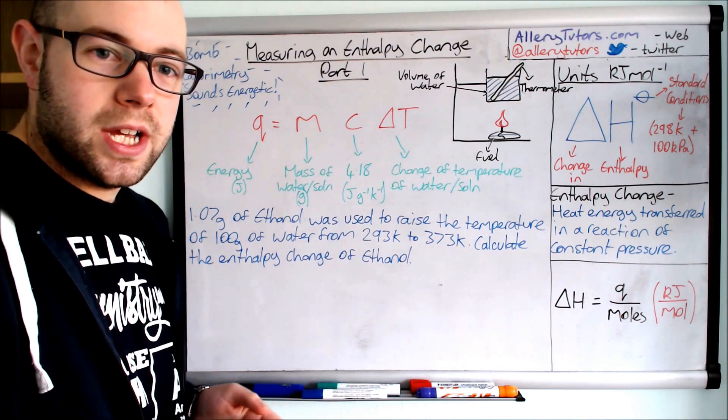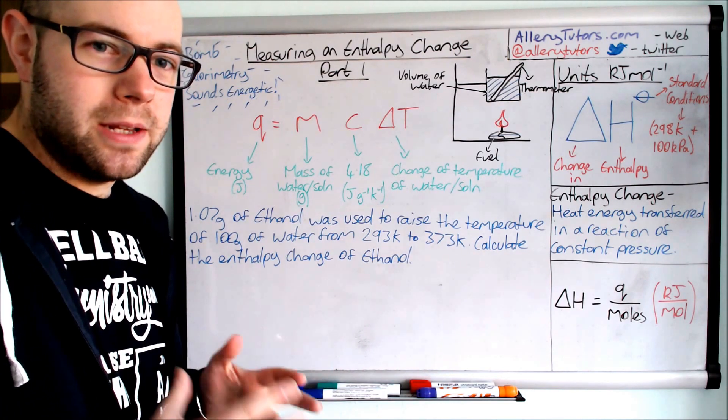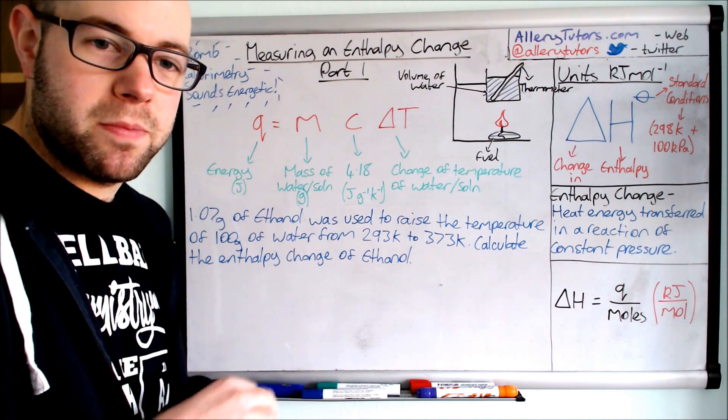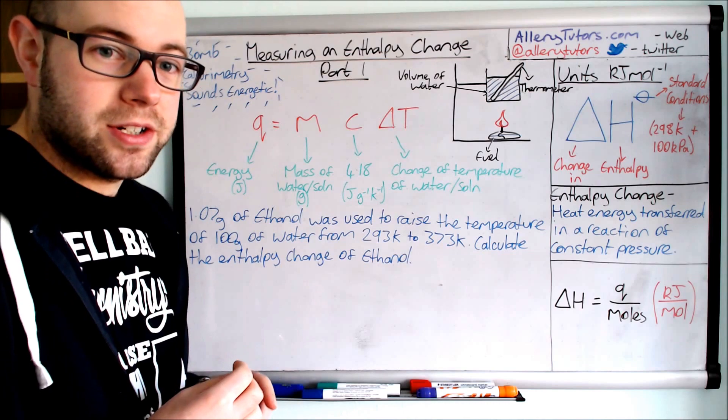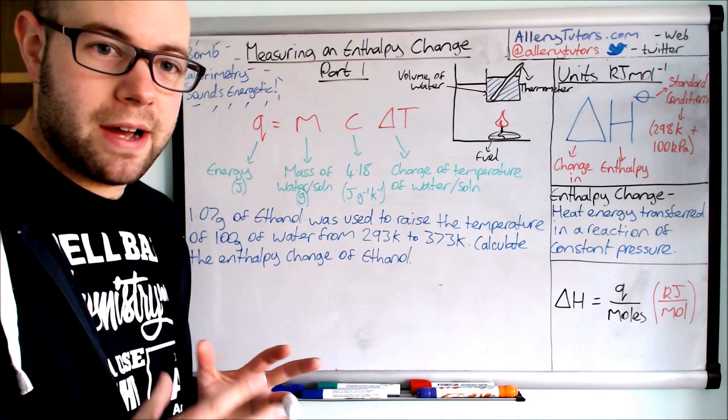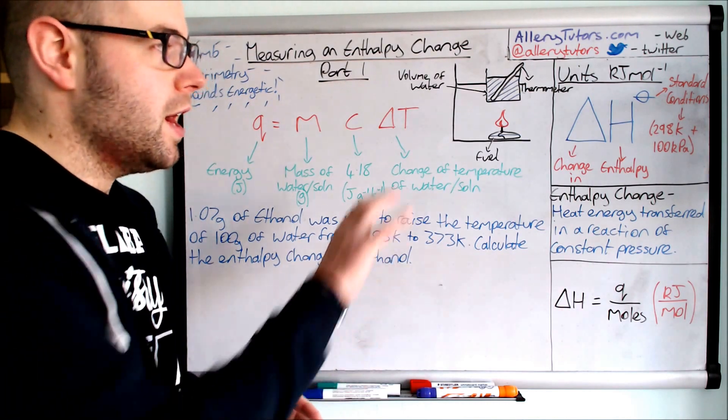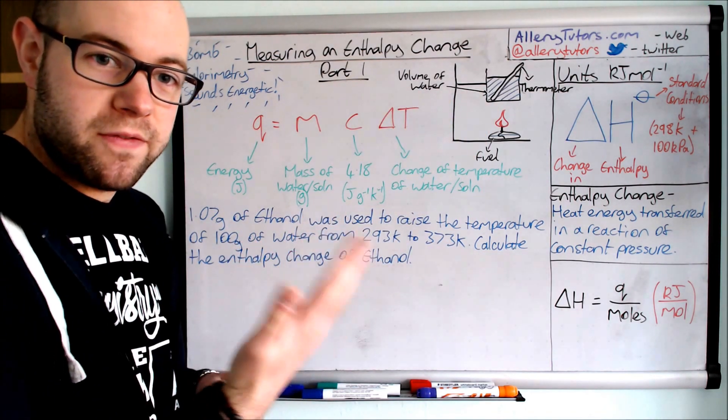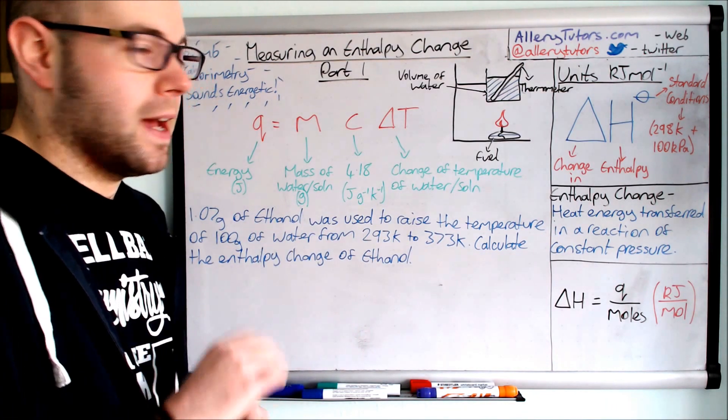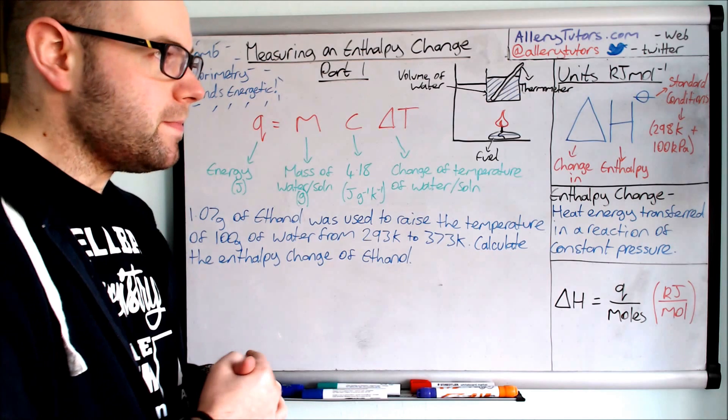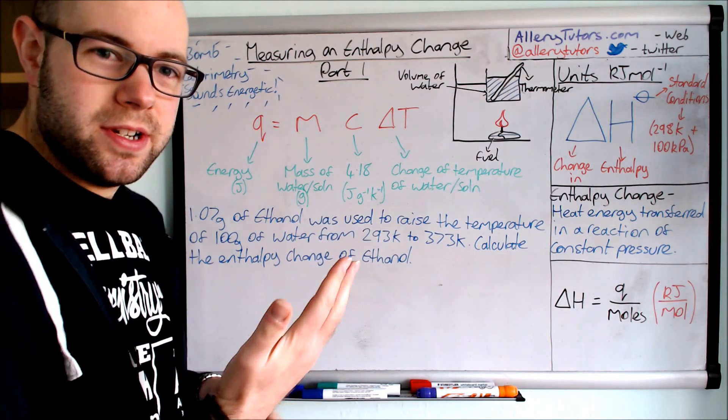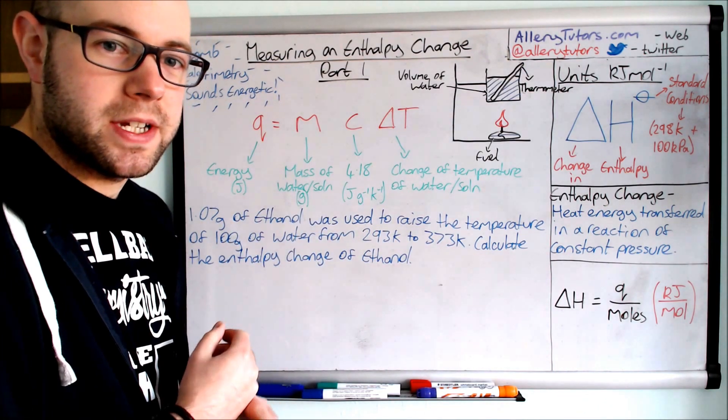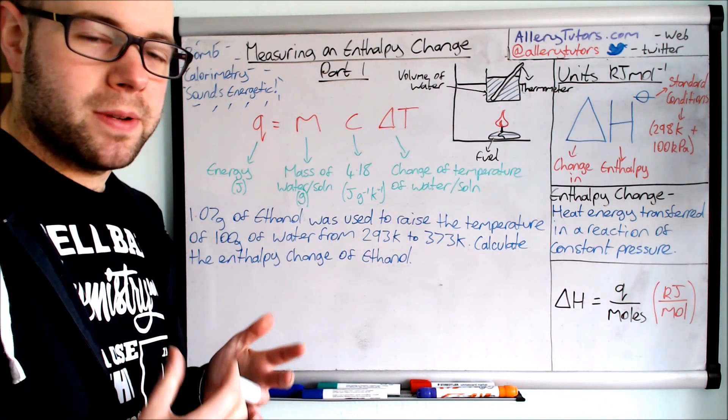I just want to talk a little bit about this practical and how it's set up. As you can see we do have our beaker there and we have our spirit burner underneath. The key thing is actually we need to put some shielding around this as well, so that could be bench mats or some kind of cover around this. What happens is the flame from the actual spirit burner flickers around quite a bit, and that's with the wind running through the room. Because it's flickering, what it's doing is it's actually spending a lot of time heating up the surroundings and not directly heating up the water above it.